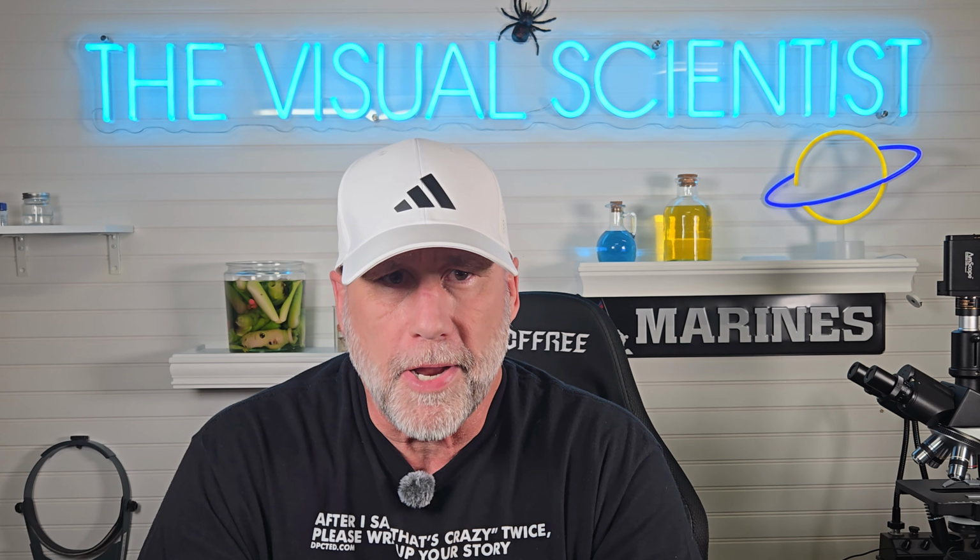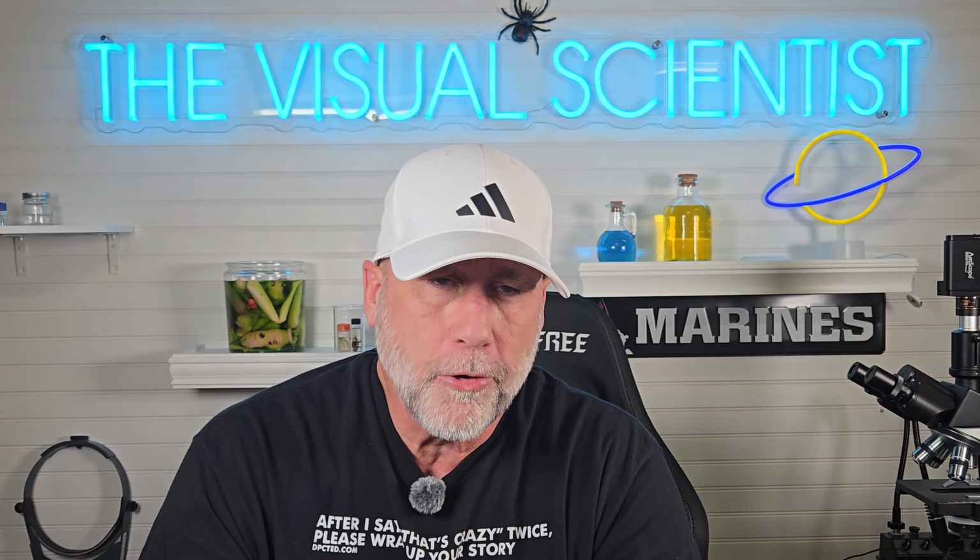1 out of 3 jars I grabbed off American grocery store shelves this week has what I call real honey in it. I'm not here to tell you what to buy, you guys. I'm just showing you the reality that marketing doesn't. The truth is in the cells.